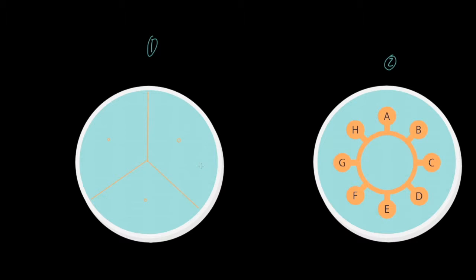Now, the only other thing, and I'm using very much creative license here, is that we're actually viewing example number 1 from beneath. What we're going to do is take a wax pencil, and as you can see here, we are going to separate the plate into 3 approximately equal sections. The other thing is we're going to prepare a little circle in the center of each section, and finally we're going to put our initials.